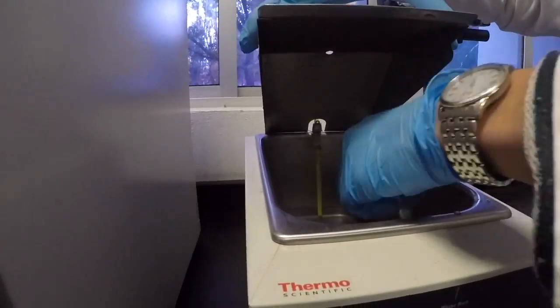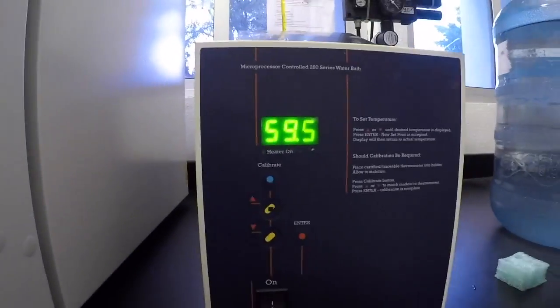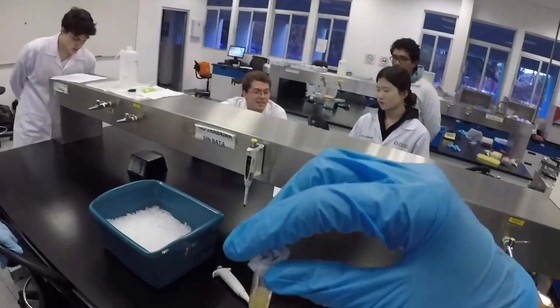The sample was taken to the incubation chamber, and the incubation took place at a condition of 65 degrees for 20 minutes. After this, the sample was mixed by inversion, only moving the solution up and down.